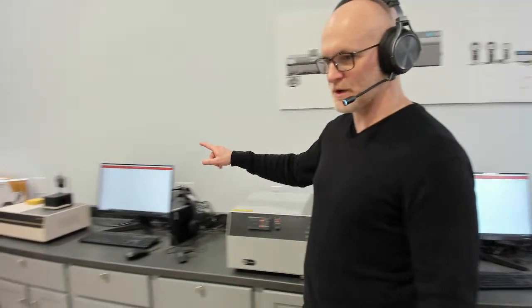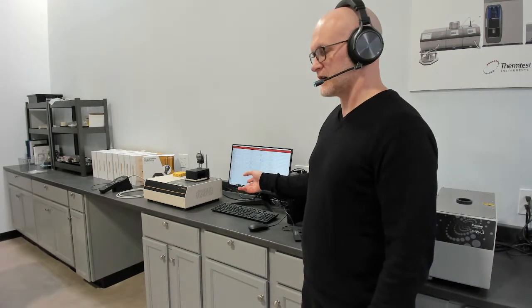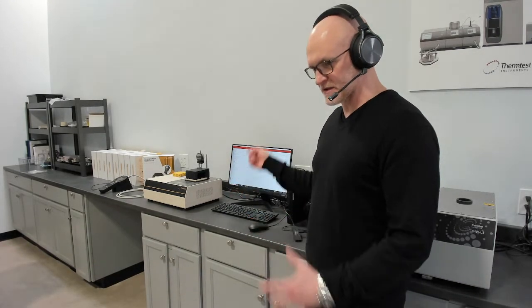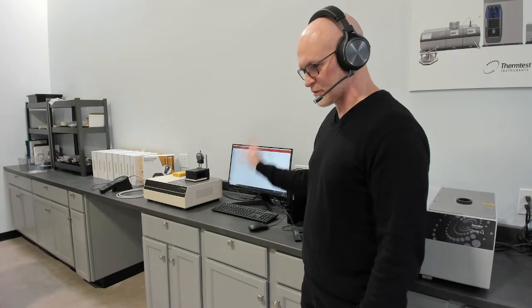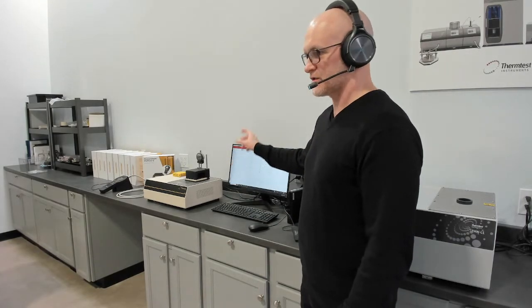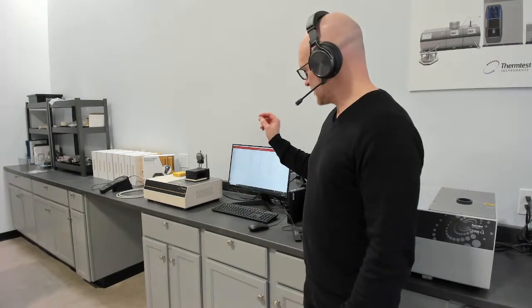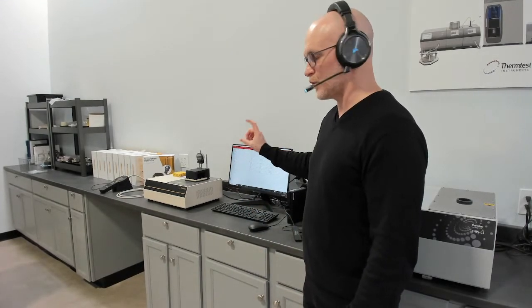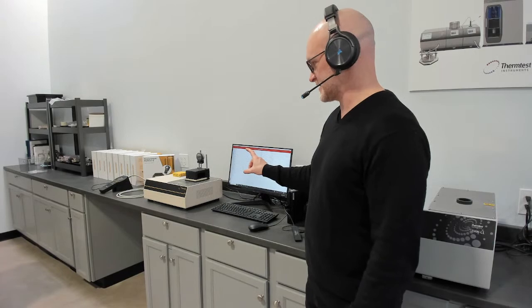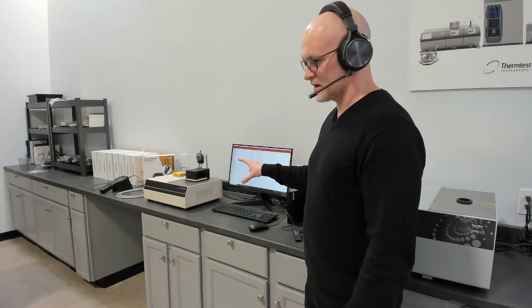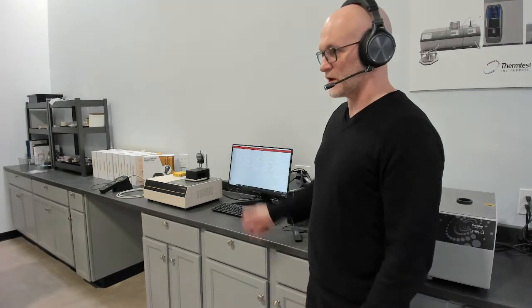This is the baby heat flow meter. We designed this method due to overuse of transient methods for measuring heterogeneous insulation, small sample size. This allows you to test down to the sample size of two inches square and two millimeters thick up to one inch thick or 25 millimeters thick. It is a very simple heat flow meter following C518.